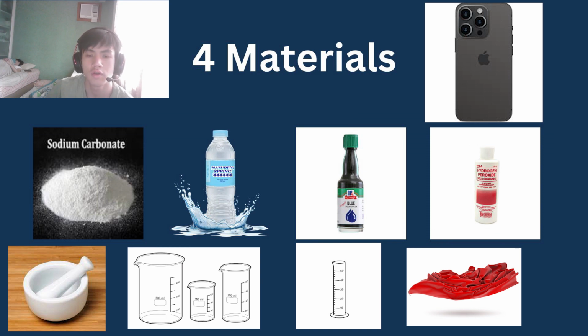For our materials, we use the following: a mortar, beaker, graduated cylinder, sodium carbonate or Na2CO3, water, 3% hydrogen peroxide, a red cloth, blue food dye, and a smartphone with the color analyzer app installed.